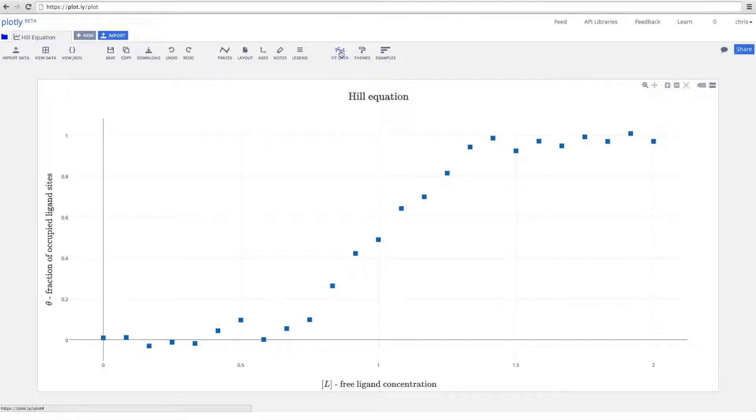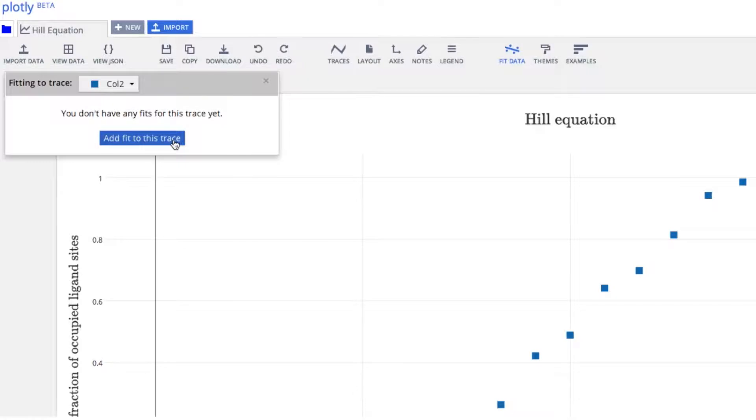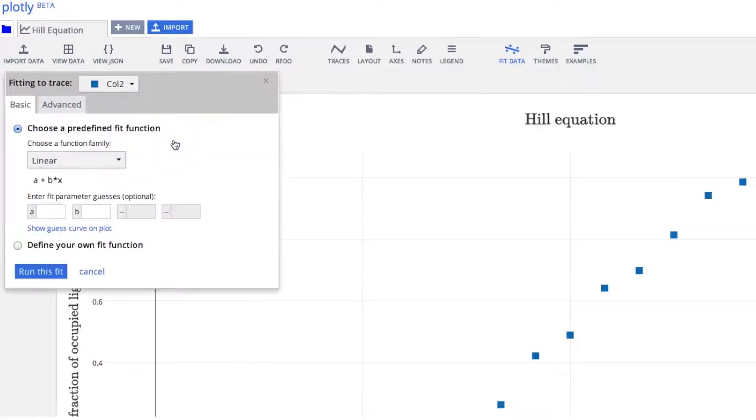Here's a graph of some non-linear experimental data from biochemistry. We'll add a fit to this data. In this case, we'll fit to the Hill equation.